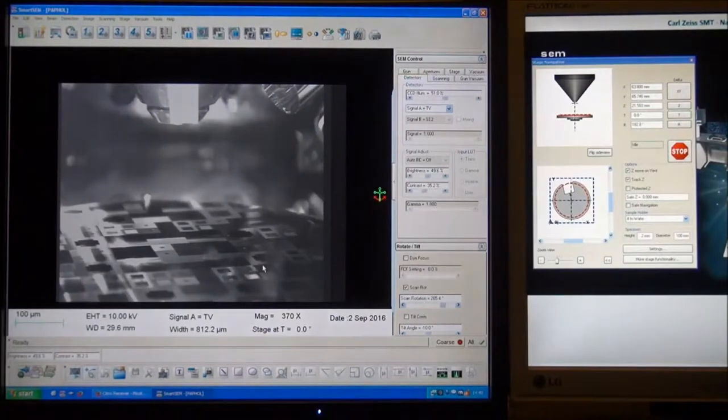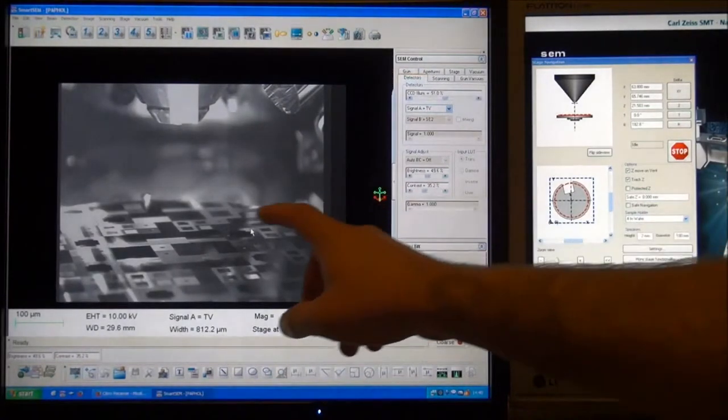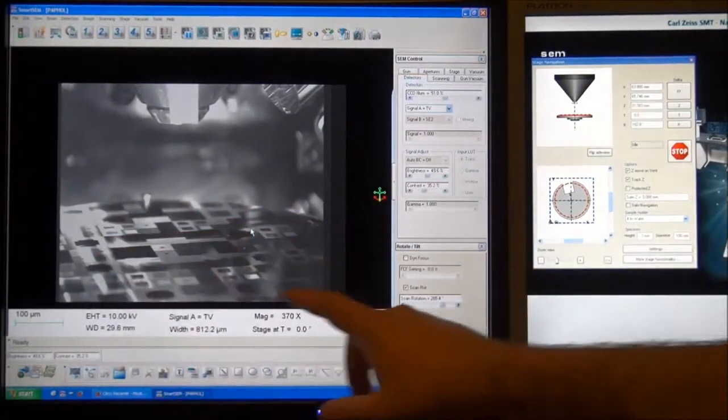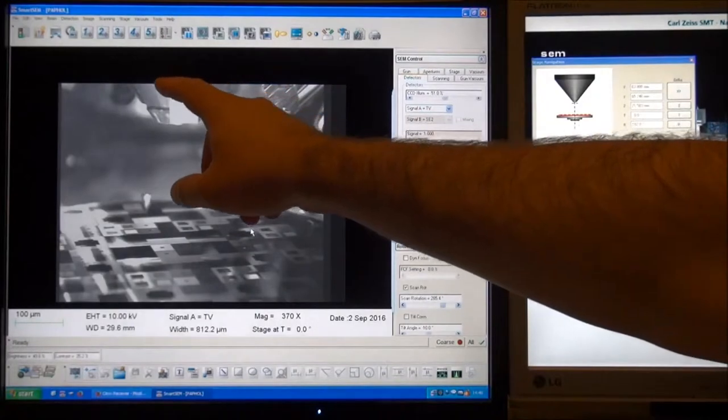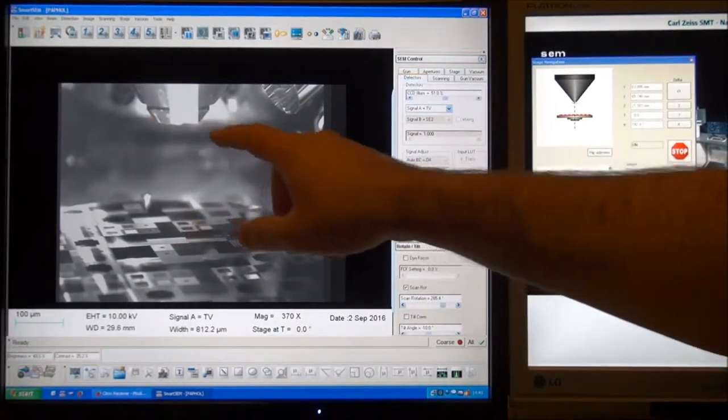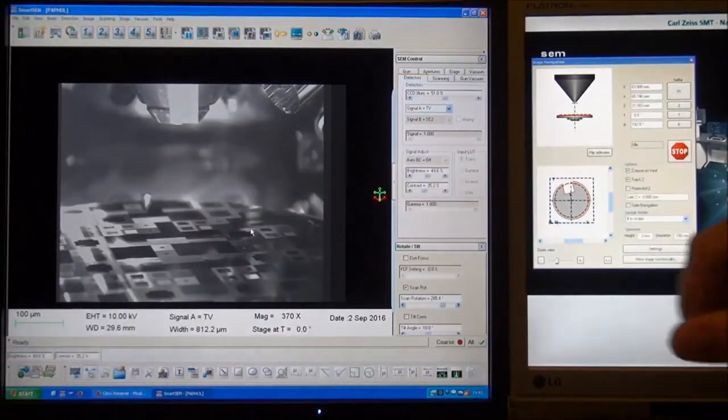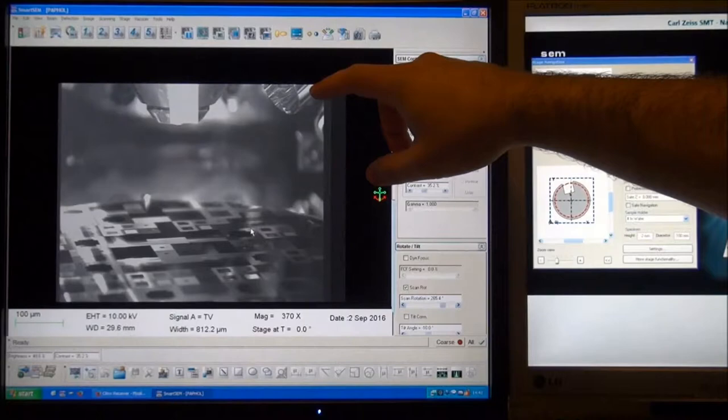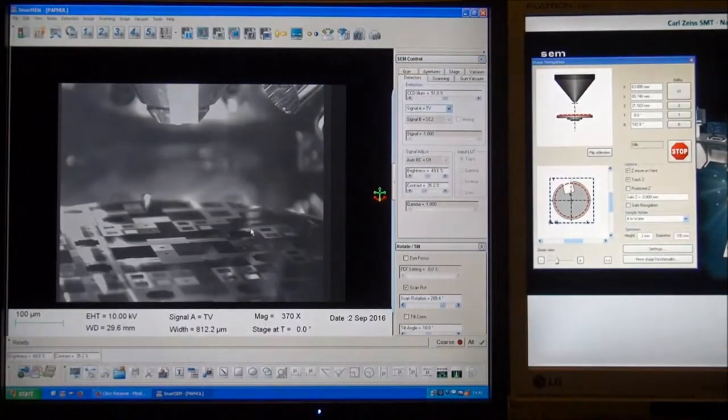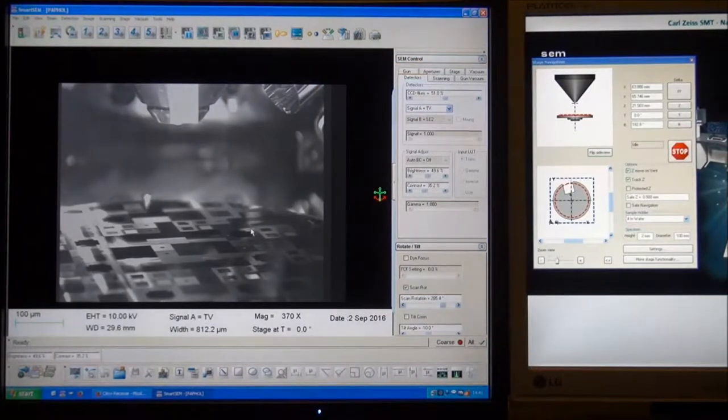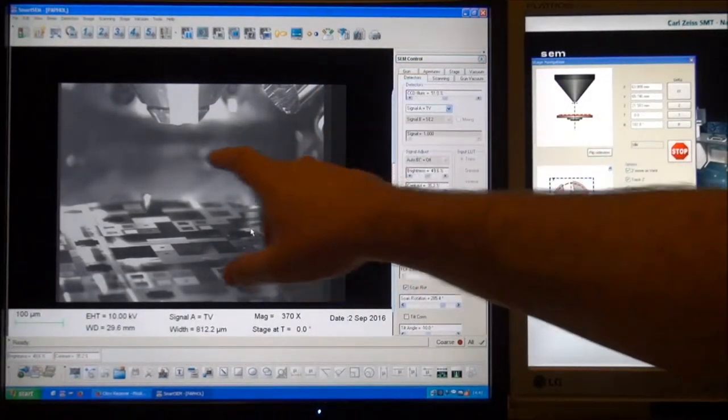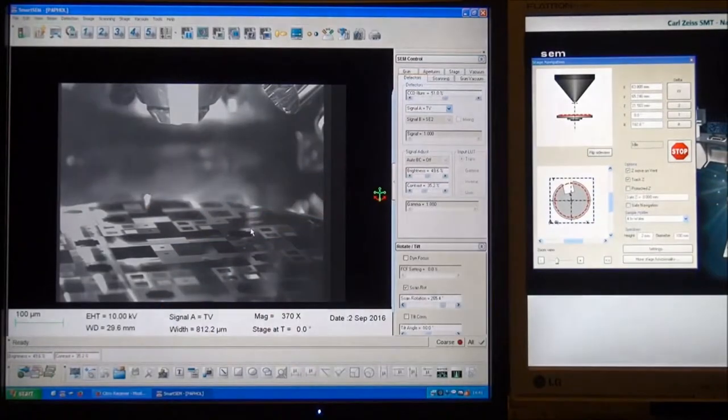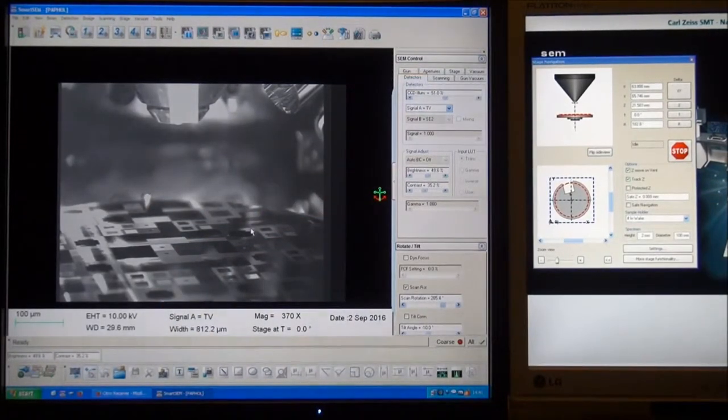So here we are looking at the wafer, and up here we have the SEM column, and the end piece here is called the pole piece. Out to the right there is the VPE detector sticking down, and in the back is unclear right now, but that is part of the stage and the door.